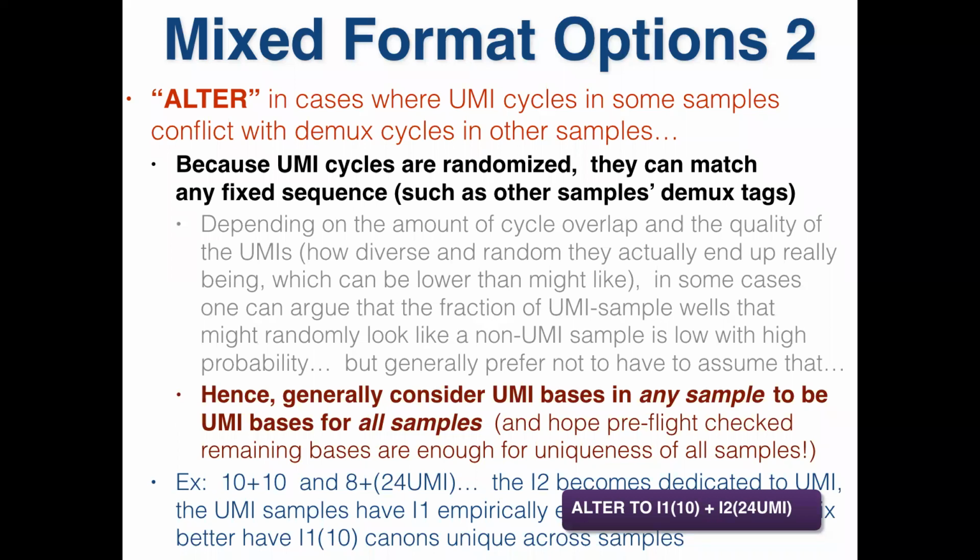Electropherograms of size and maybe the input fully marked. Your job is to get your raw material to the defined input. That's the life. That's the kit maker.